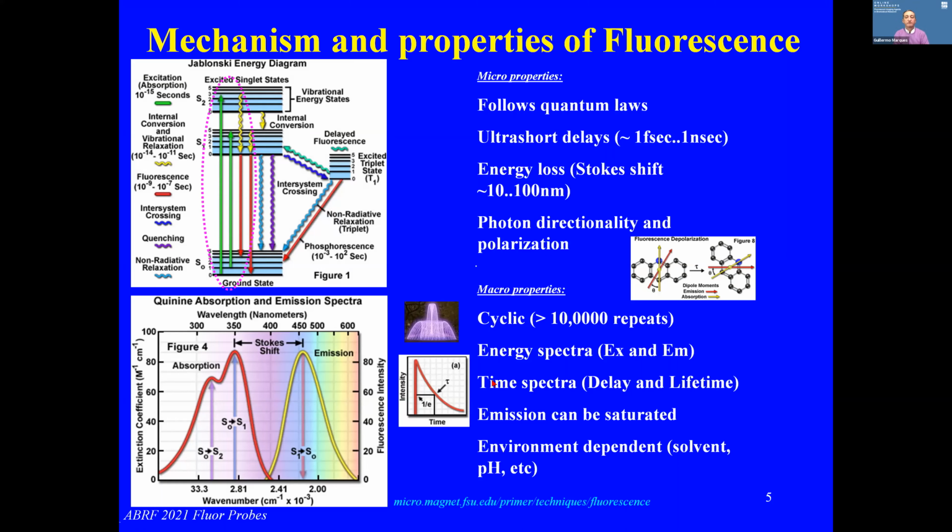And this is, by the way, the basis of these FLIM methods, that fluorescent signals from different probes can be filtered not only by their fluorescent spectra, but also by their timing spectra.